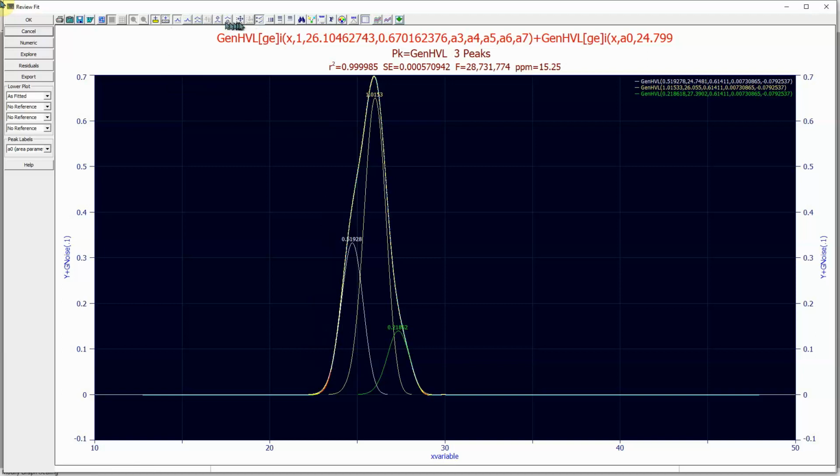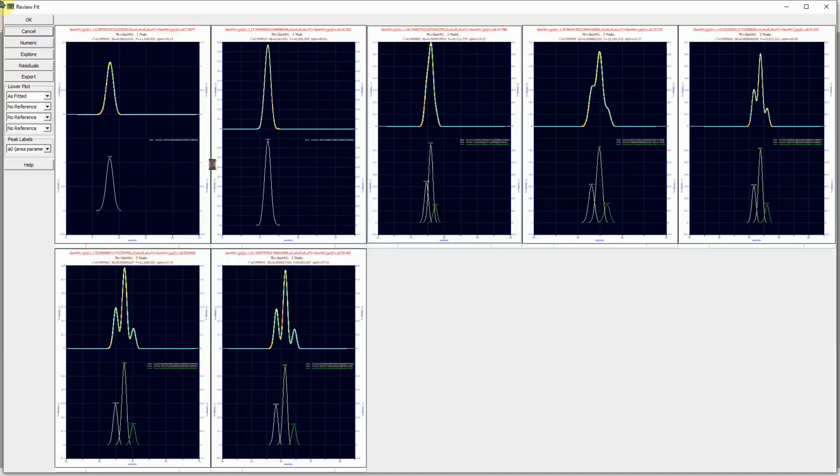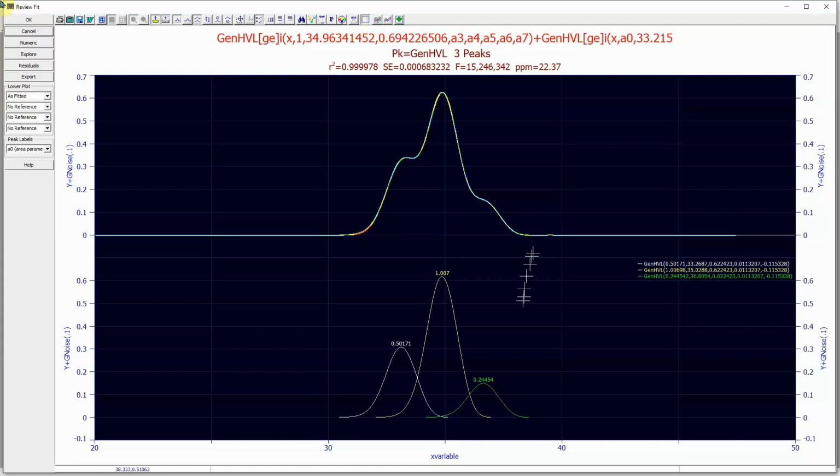Let's just look at the individual peaks. You can see that there's more than a single peak there, but it's hard, and you can see we've got all three of them to a reasonable accuracy. We'll do better if we go to the 40, which is the next.